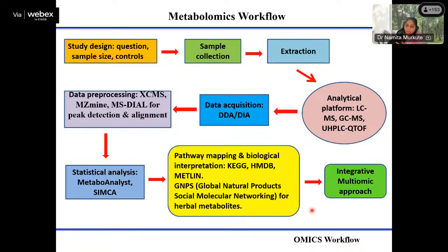That means there is a relevance between this particular pathway and your objective or your question. This multiomic study, integrating all these results, can be done by MetaboAnalyst. In this year, 2025, they have added this particular feature in MetaboAnalyst.